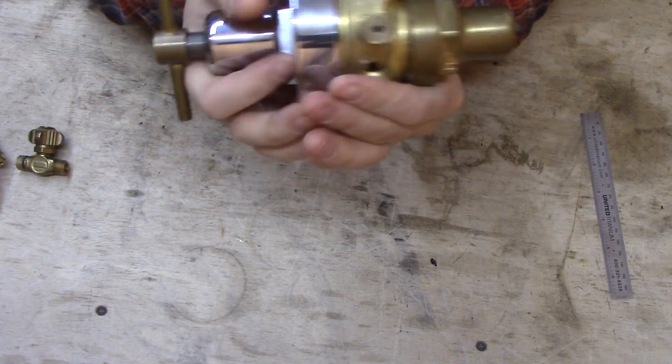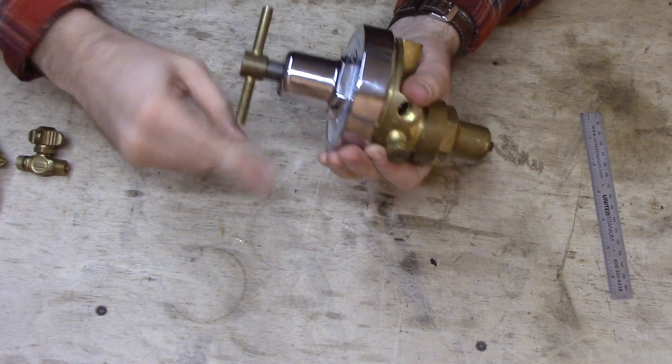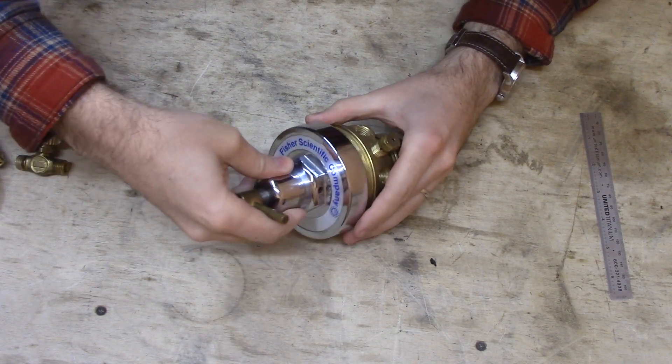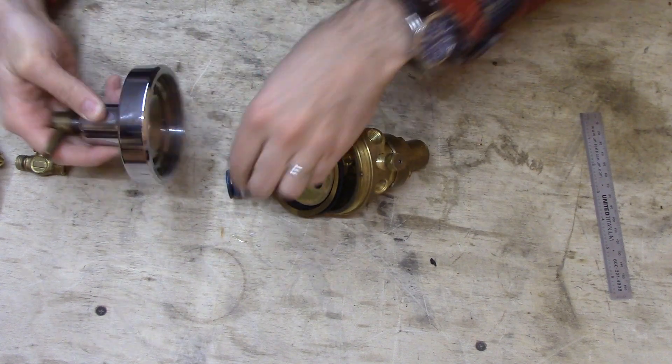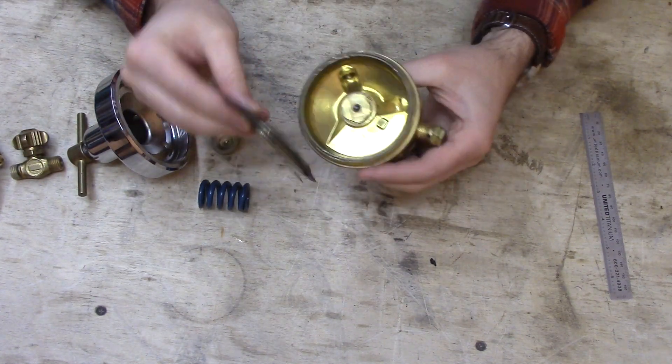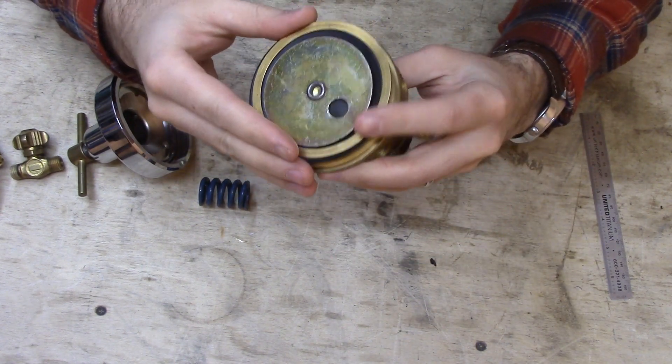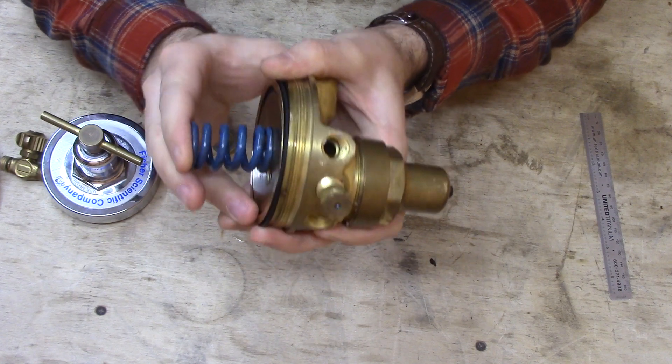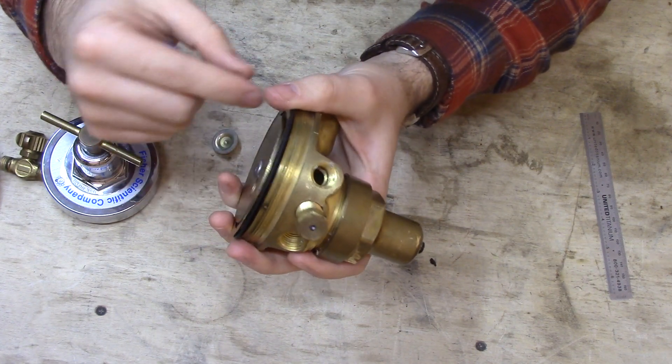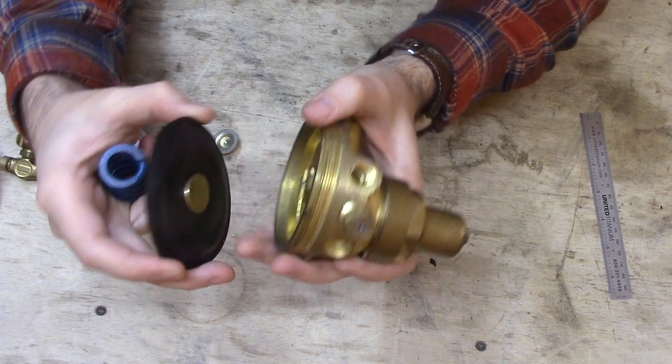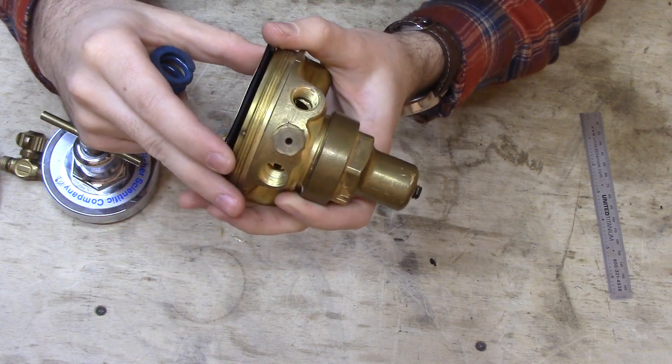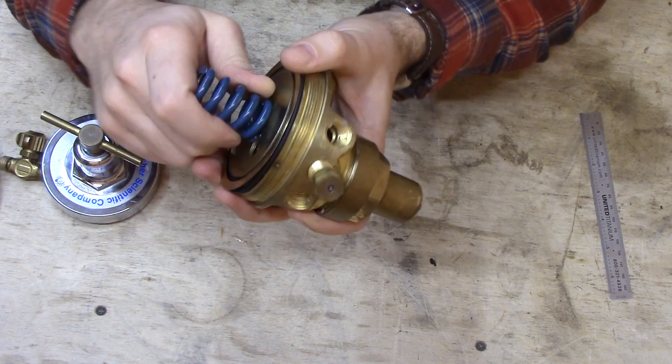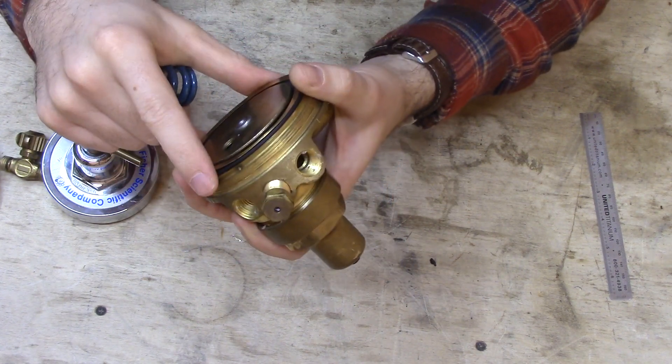If I unscrew this front part, this is where the action really happens in a regulator. What you see is a big spring and a rubber diaphragm. So what happens is when you turn this knob on the front, you adjust the pressure that's pushing on this spring. And the outlet gas pushes on the back side of this diaphragm, so it tries to push this diaphragm out and the spring pushes it back in. And at some point those two forces are equal, and that sets the output regulator pressure.